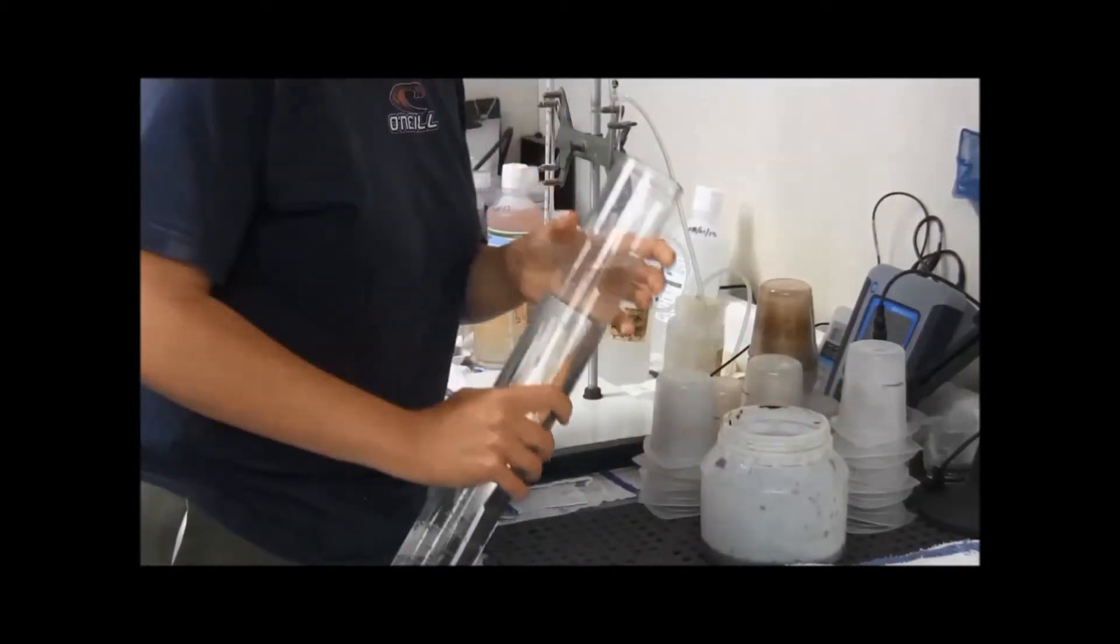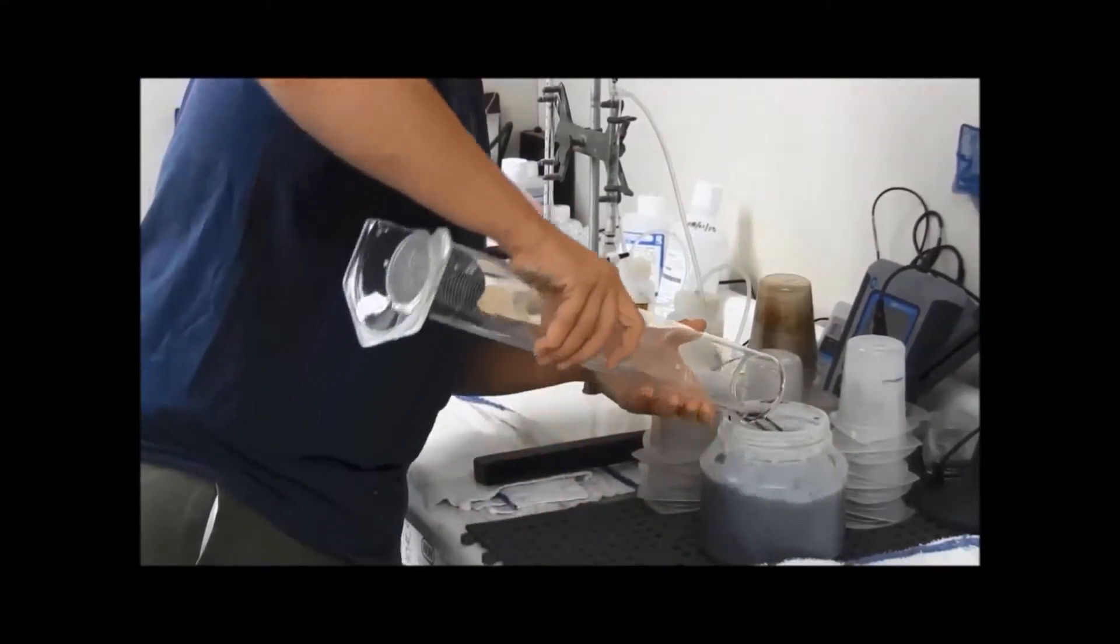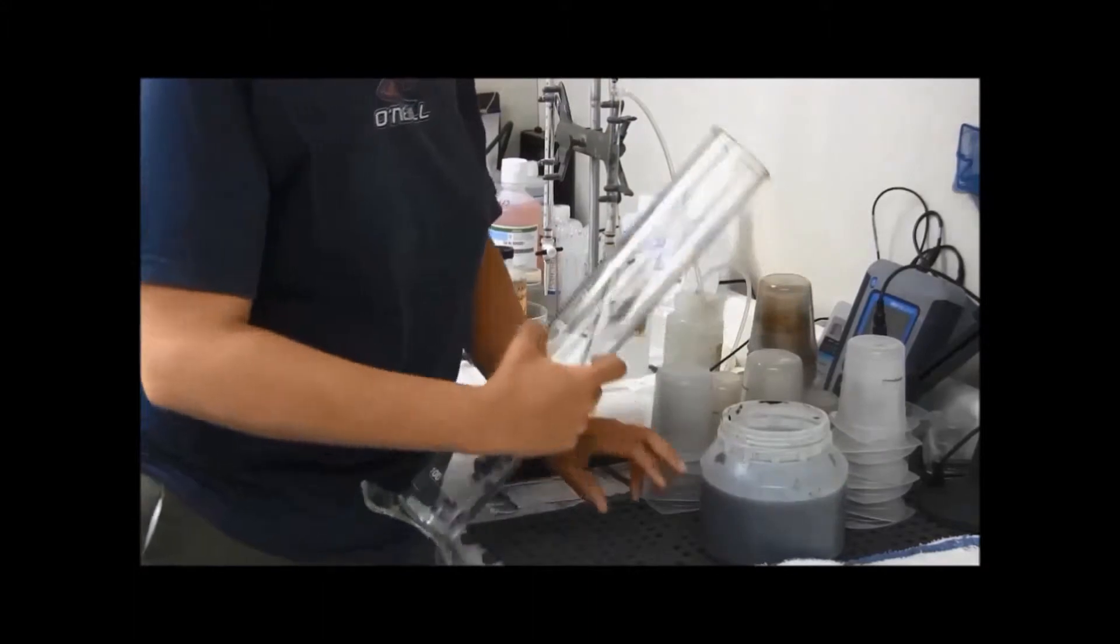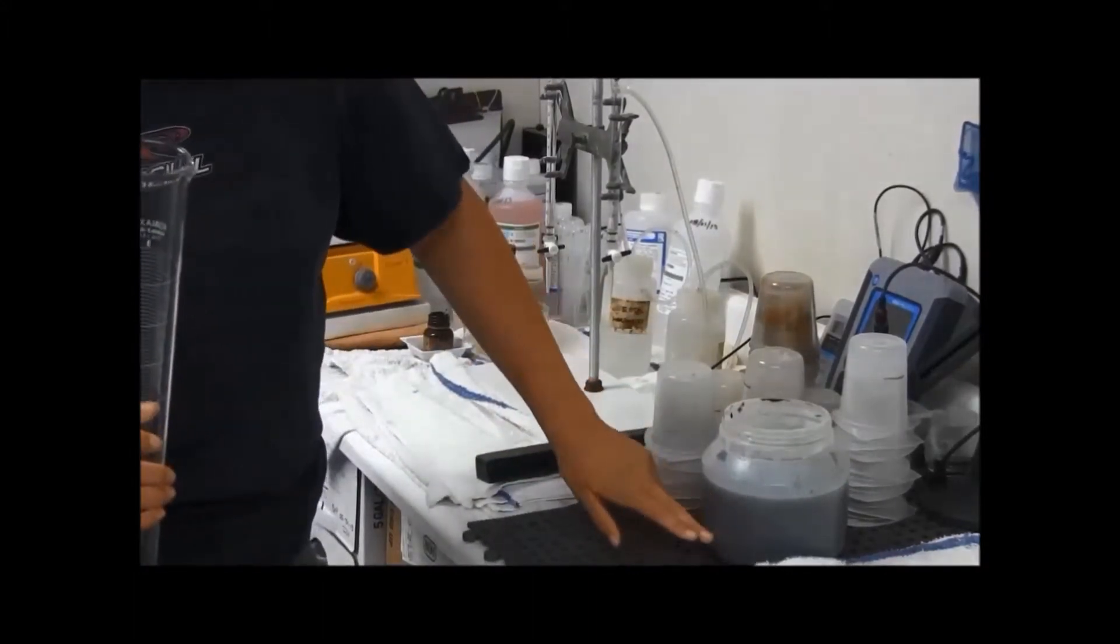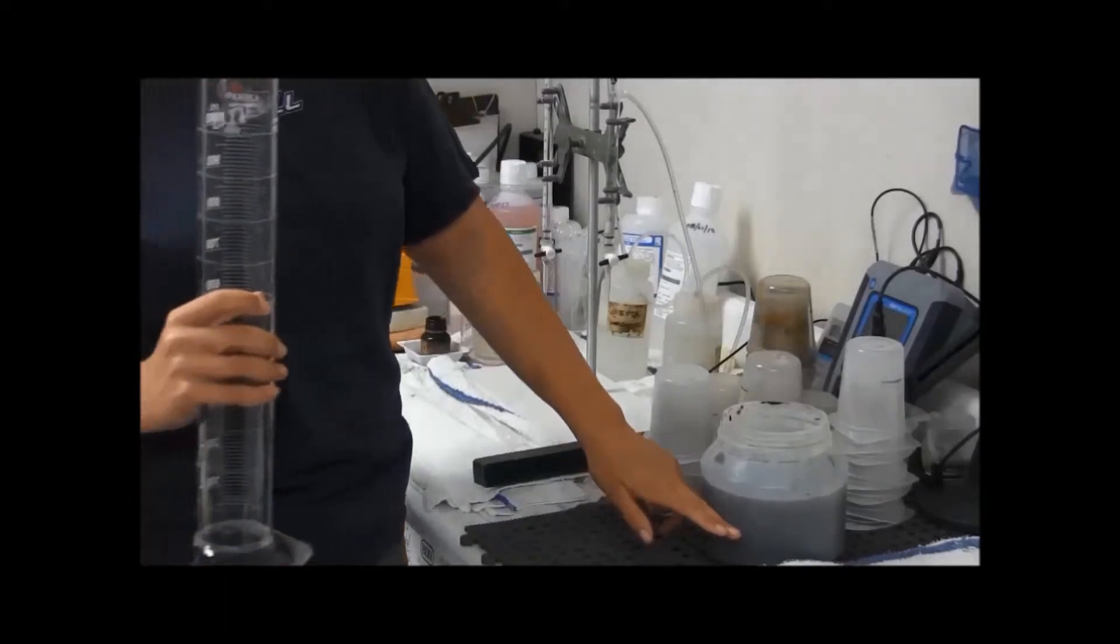Now, you always want to make sure that all of the organic material and the bugs are no more than halfway full in this container. Otherwise, it will continue to dilute with all the organic material, like if you have a lot of algae in it. So you'll just want to make sure that it's right at half.